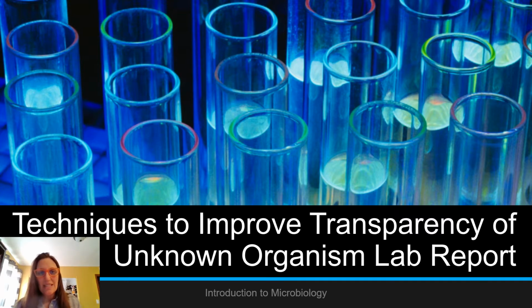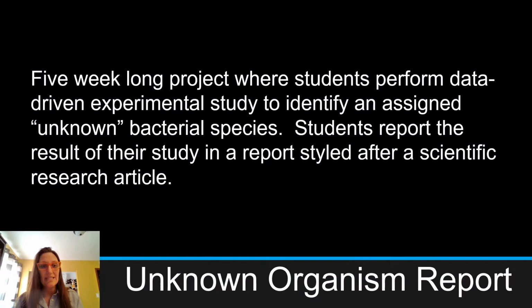This project is an unknown organism lab report. After the students have learned the basic techniques, they participate for 5 weeks. They get a bacterial species that they don't know, and there are many different ones, so each person does not have the same one. They need to do a series of tests and decide what tests they will do next based on the data they received from previous tests.